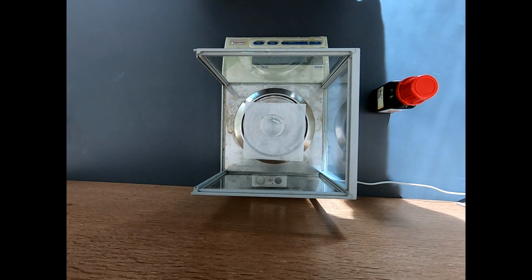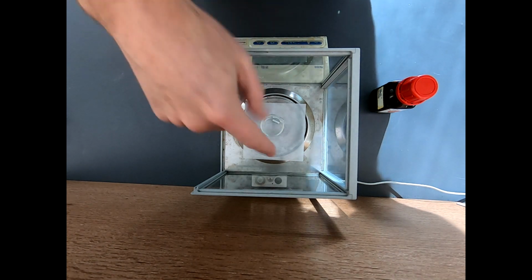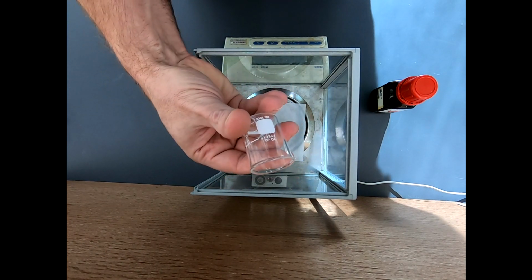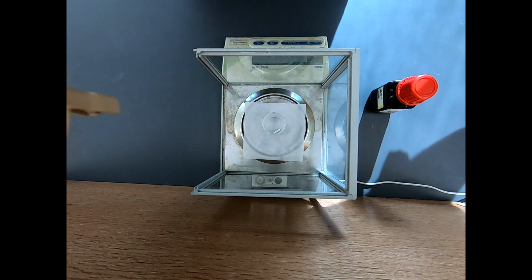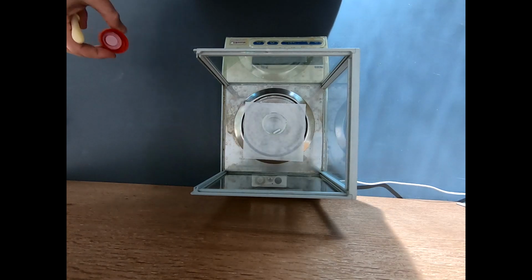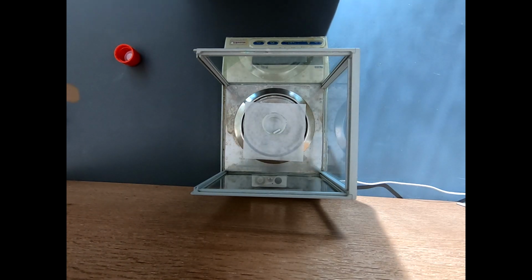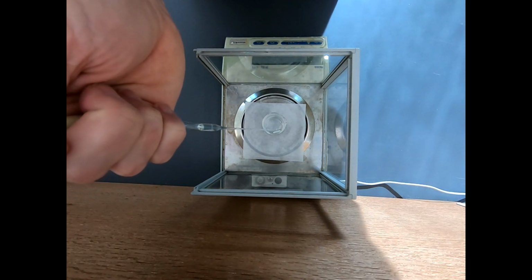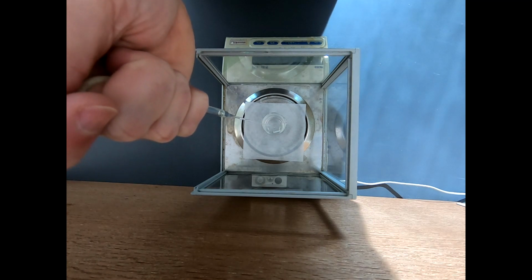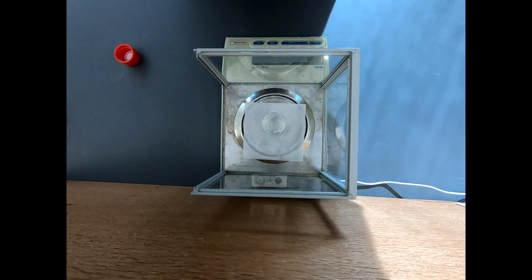Now, weighing liquids out on the balance, there's always mistakes that can happen. You don't want to drip on the pan, so I've put this weighing paper on the pan, but this is just a 20 milliliter beaker. So let's go ahead and get started with our salicylaldehyde. And I am not going to be super careful at all. I know what I want. I want about 6.11 grams. And so I'm just going to transfer this by pipette until I get very close to 6.11. If I go a speck over, that's okay, as long as that speck is not too big.